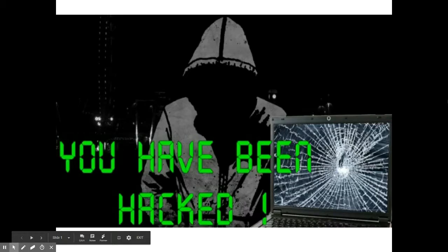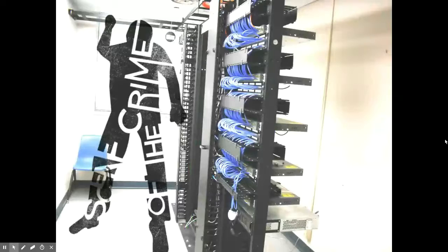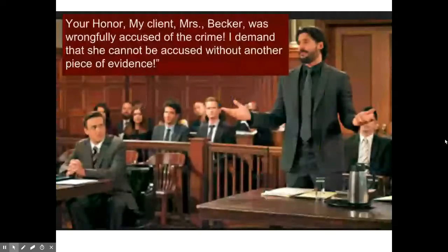On Friday, we completed part 1 of the Murder Mystery Lab. In part 1, we tested the DNA of the 3 7th grade science teachers, Mrs. Arbaji, Mrs. Becker, and Mrs. Zuhl, using restriction enzymes. In that part of the lab, you discovered that the hair found at the scene of the crime matched Mrs. Becker's hair, and you thought you had enough evidence to convict her based on the DNA evidence. But now, Mrs. Becker's lawyer is defending her, saying that she was wrongfully accused of the crime.